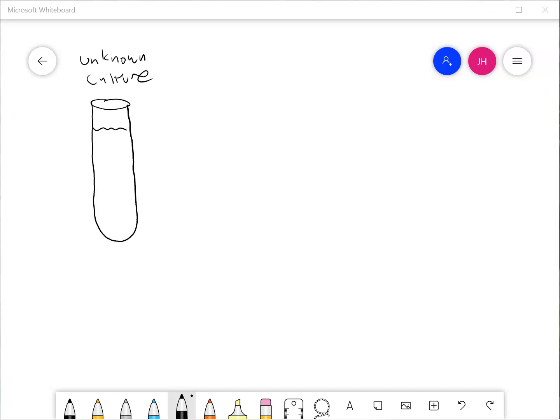In this video, I'm going to walk you through the plate count technique, and by necessity, I'm going to review serial dilution. So why do we do serial dilution and why do we do the plate count technique? First, the plate count technique is a way of quantifying the number of live microorganisms in a sample. And so it's like just asking how many live cells are in this liquid.